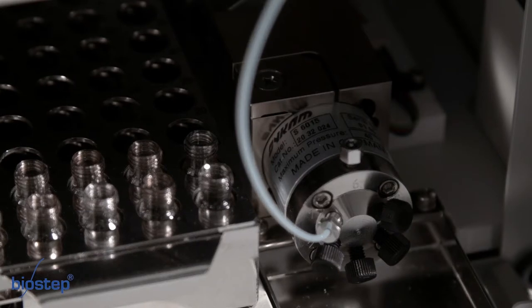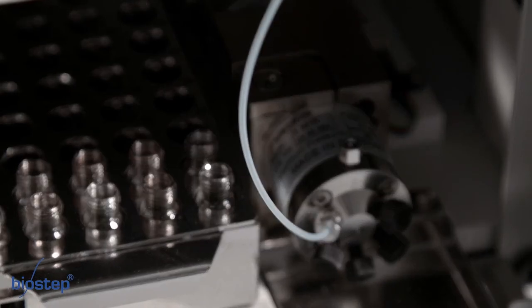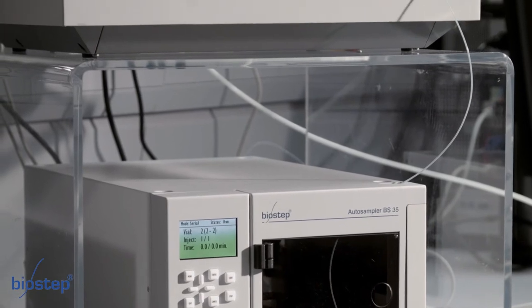A capillary tube connects the valve of the auto-sampler BS35 with a dosing syringe of the AS30.